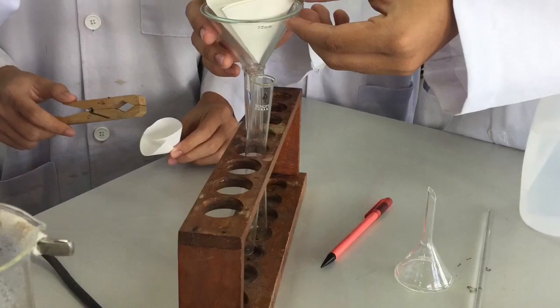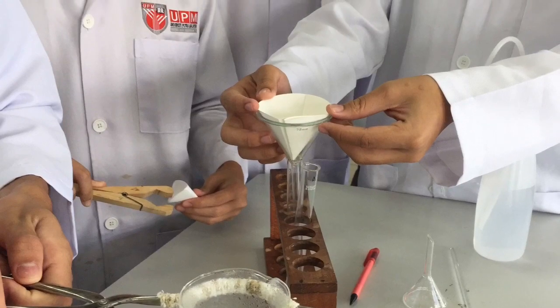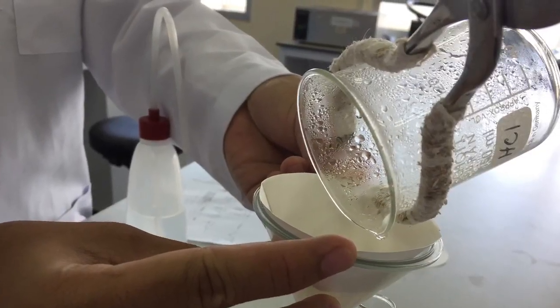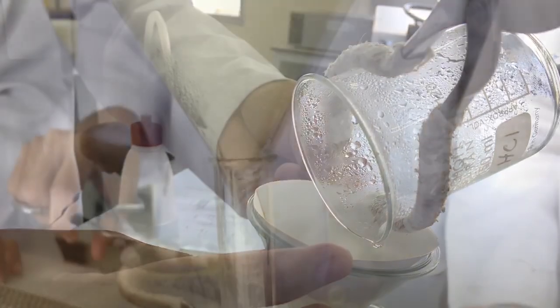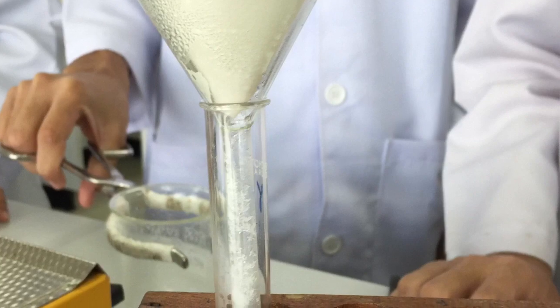The hot solution was filtered into the test tube by using the filter funnel and the filter paper. The solution was cooled for 10 minutes.